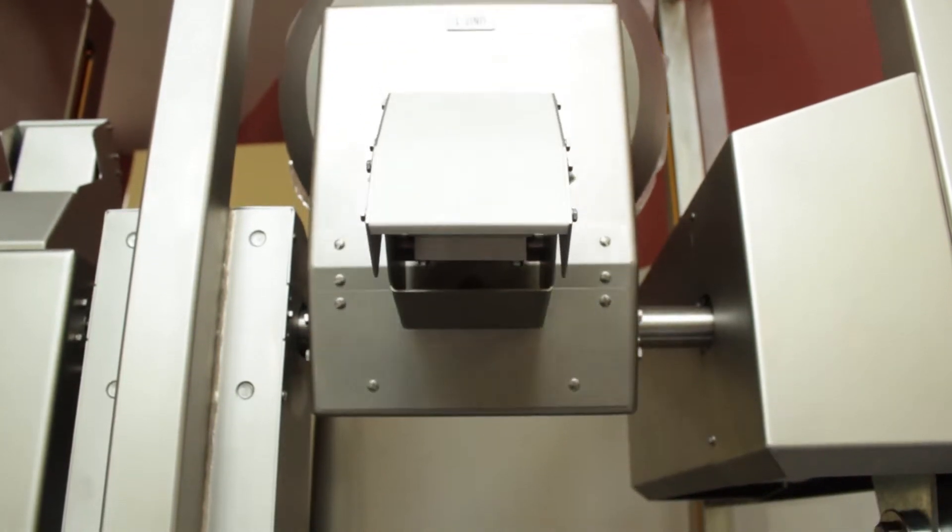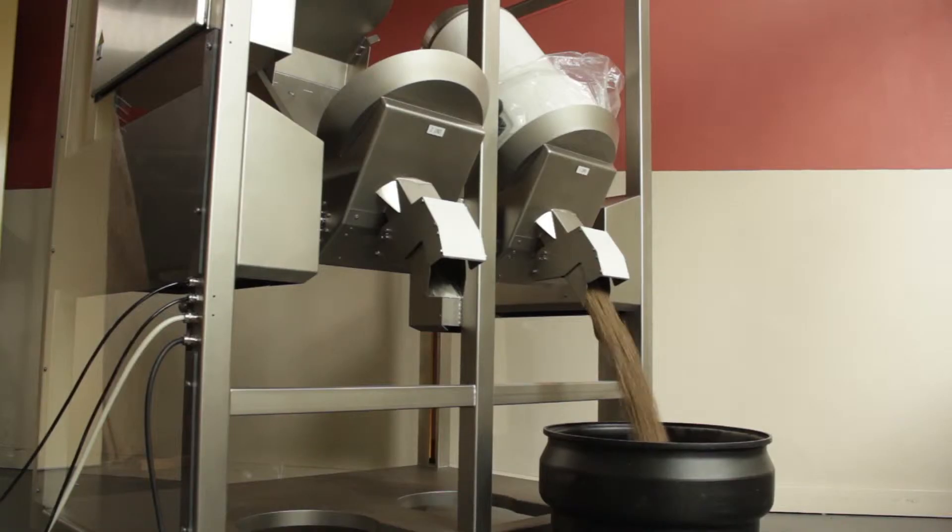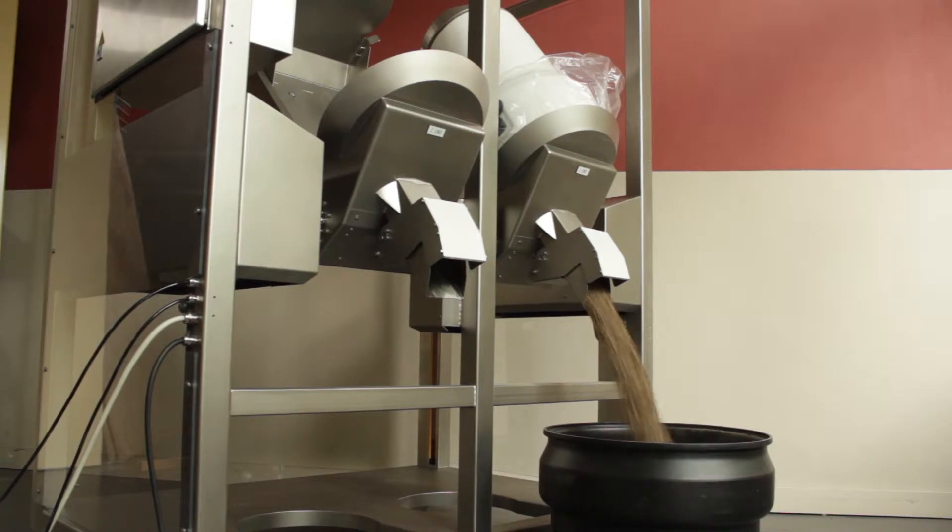If the tablets in the hopper are kept in a protective atmospheric condition, the hopper will be provided with special valves in the lid to fill it. The drum tipper will control those valves.